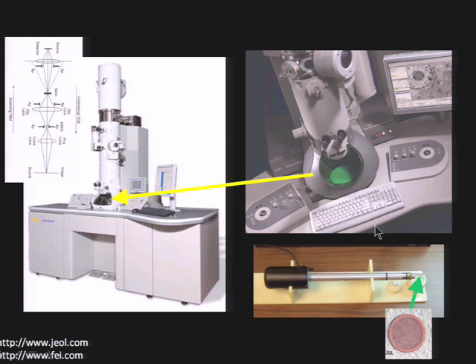And I mean, certainly you can imagine that the sample that you would put in one of these microscopes is super, super small, and this is a sophisticated and sort of challenging imaging technique, but the preparation of the sample is also pretty challenging. You can imagine for an SEM, I mean, you need to prepare your sample and get it on the post and put it in, it has to be conductive and anchored and so on, but to get a good image in TEM, you need to have your sample consisting of the nanostructures you want basically suspended over a hole and thin enough such that the electron beam can get through it.